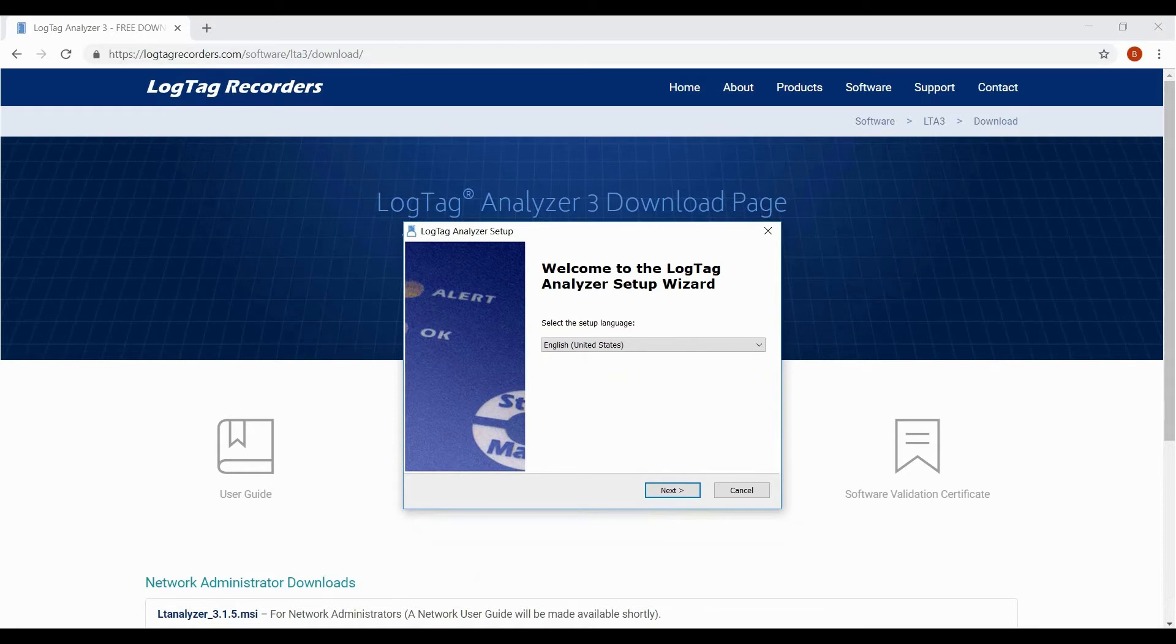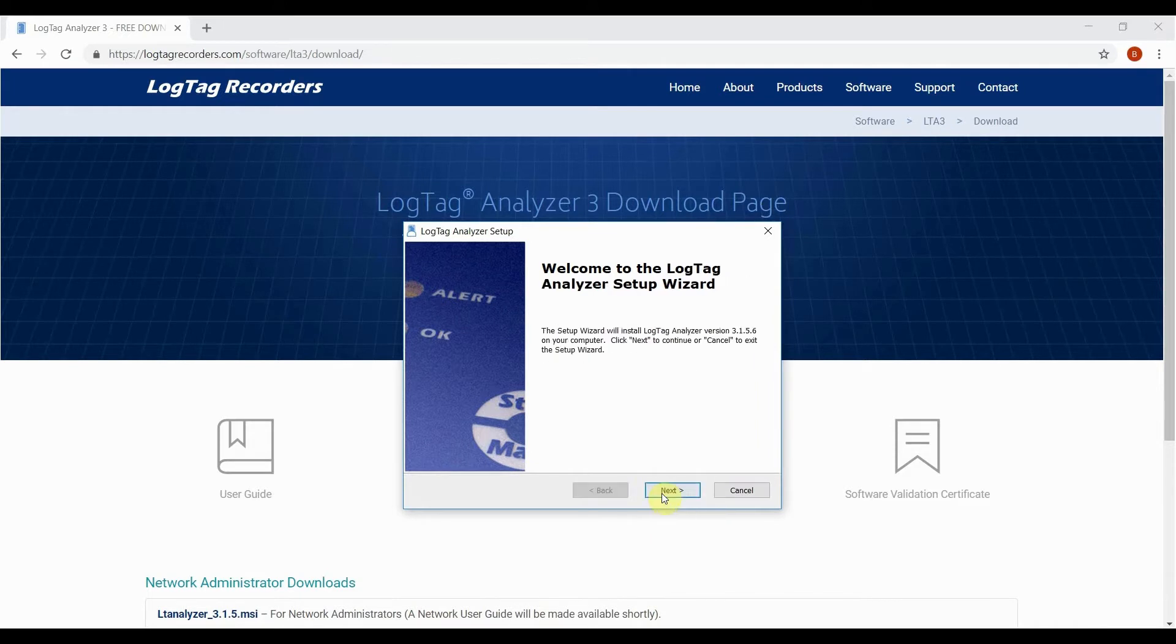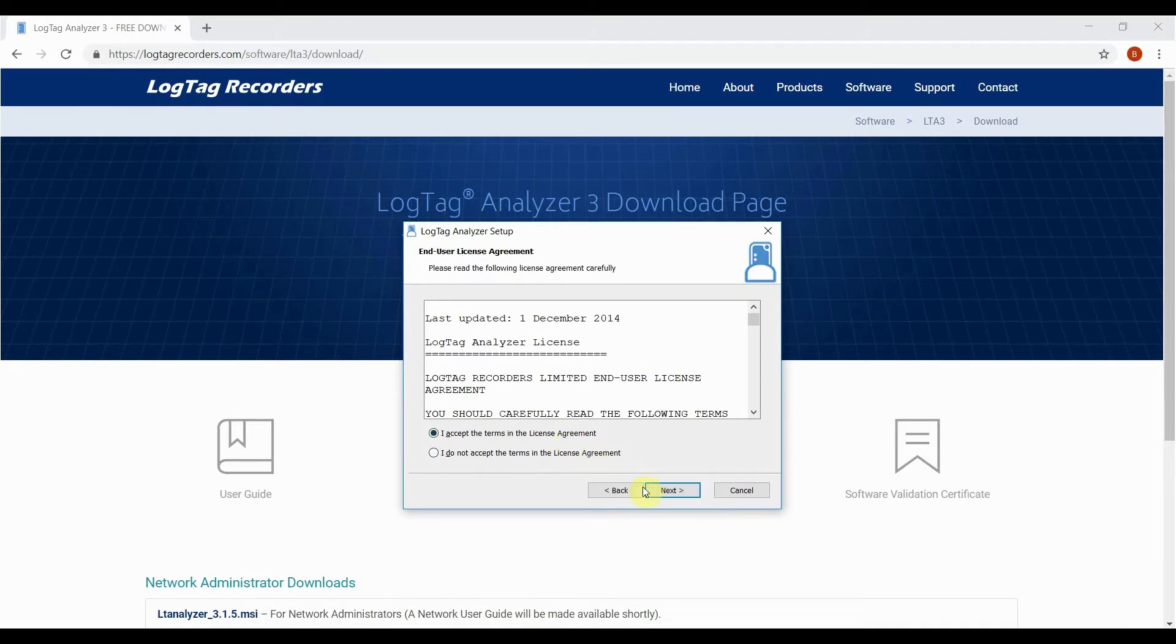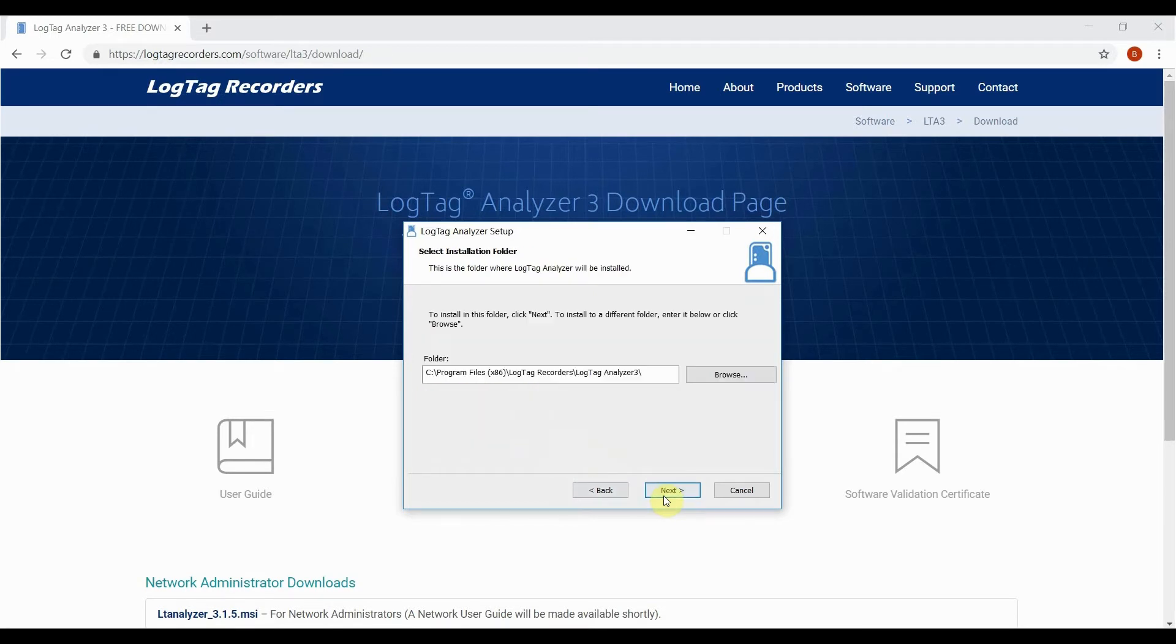Change the language now if required, then click next and next again once the setup wizard has loaded with the language you've selected. Read the license agreement, then select the I accept option in order to click next to continue.